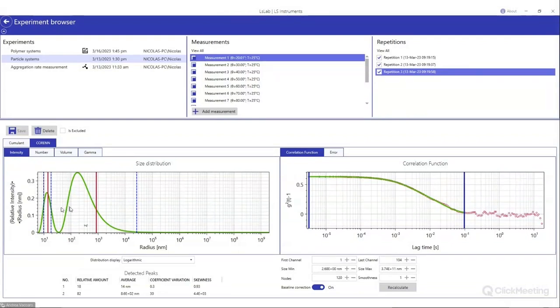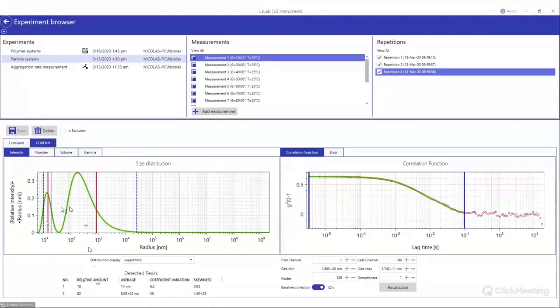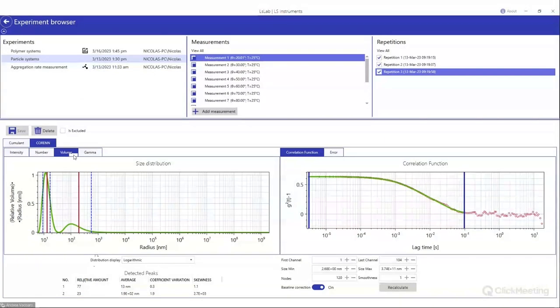Below the particle size distribution graph, the peaks are listed with their relative amount, average size, and coefficient of variation. The user can also select a different weighting — many particle analysis experts prefer volume-weighted distributions because results are more comparable with other sizing techniques. Switching to volume weighting, the smaller peak becomes relatively larger as expected. The user can also display a cumulative distribution to appreciate values such as the D90.